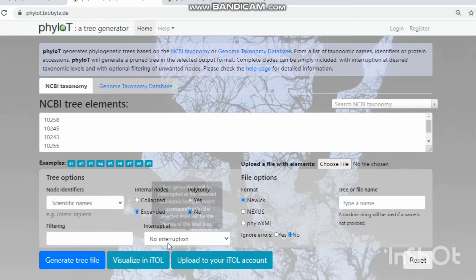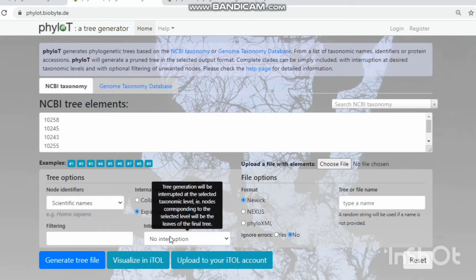The interrupted option means tree generation will be interrupted at the selected taxonomic level — you can give the taxonomic level of family or order.